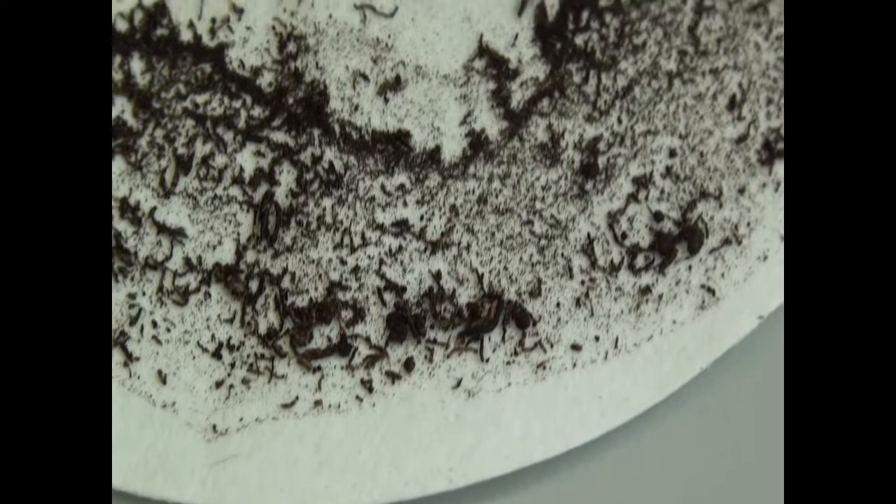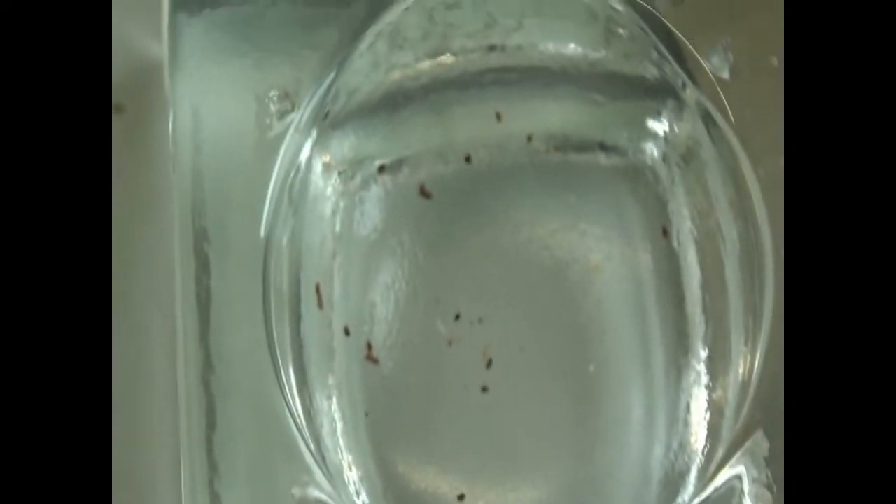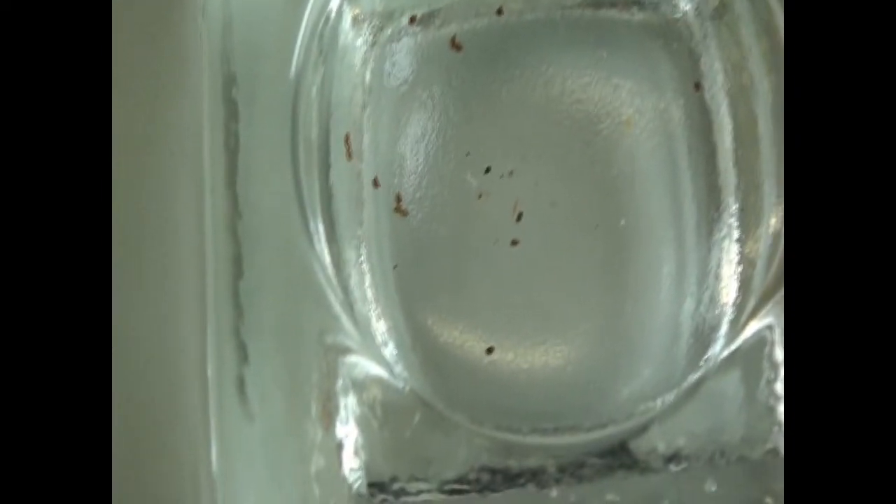This is how the cysts will look post drying and concentration on the filter paper. If you go ahead and pick them out, they'll look like this.